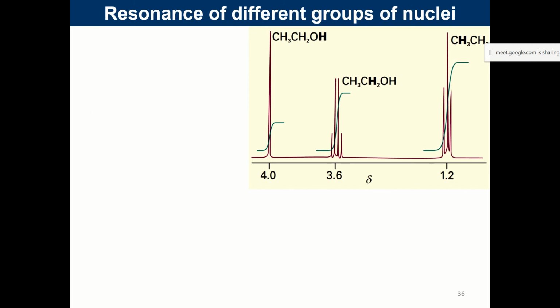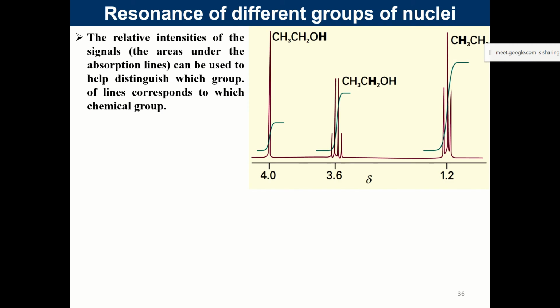So, okay. In the last class, we understood the basics of NMR spectroscopy. We have moved to analyzing some of the spectra in finer detail, and the first example was that of ethanol, where you have three different types of hydrogen atoms in different types of environment.